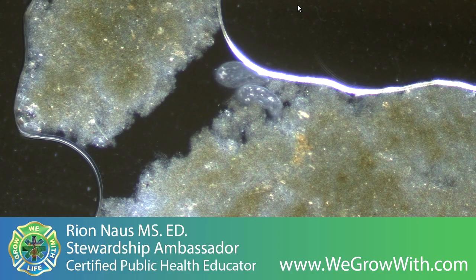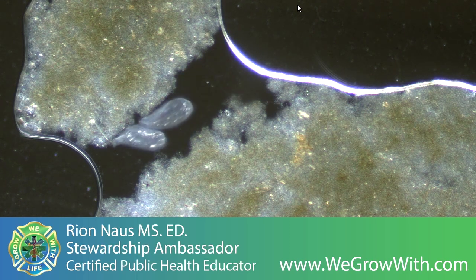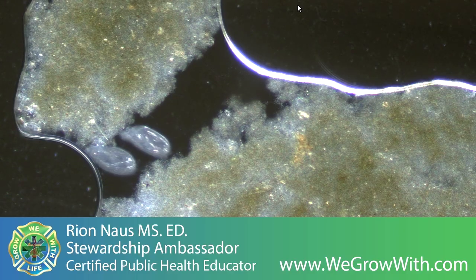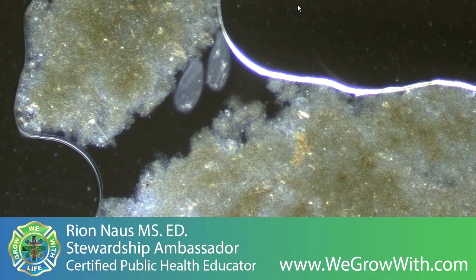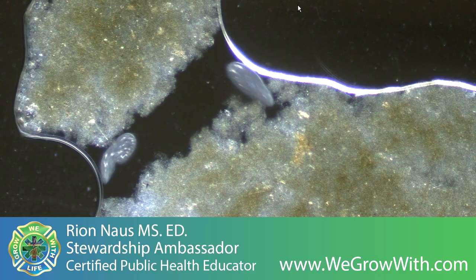So in a few more minutes, when they can't move at all, we'll have the opportunity to see that transition. And while we witness that, it always creates, for myself, a greater perspective on the rest of that aggregate we see closing in upon them.